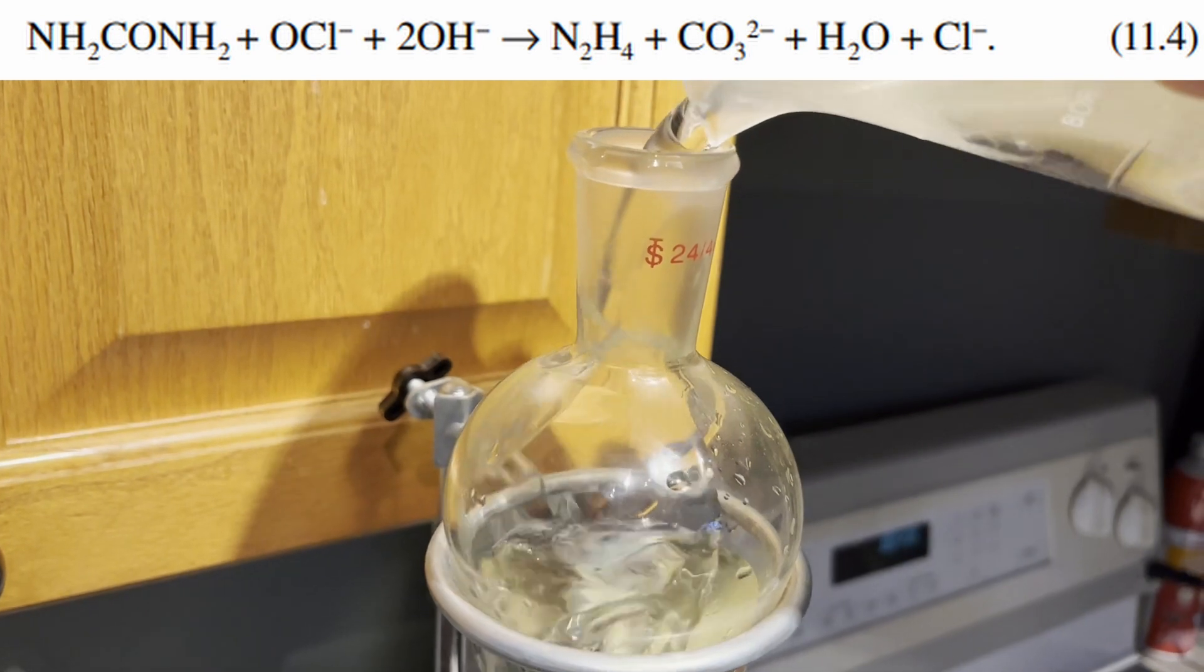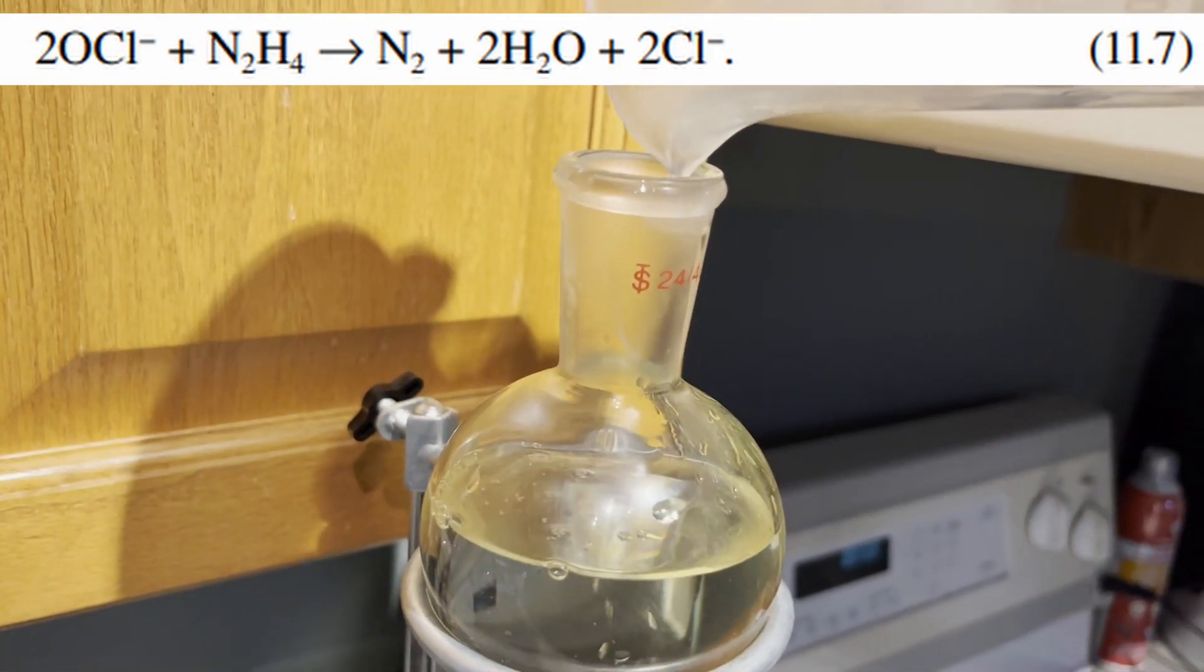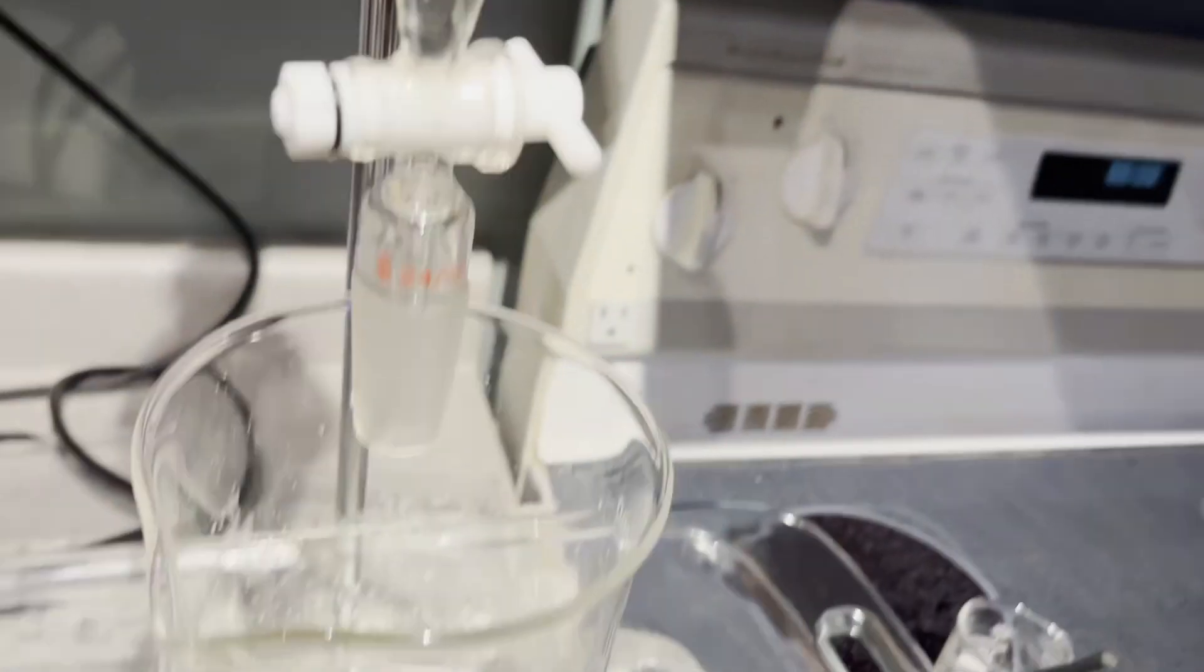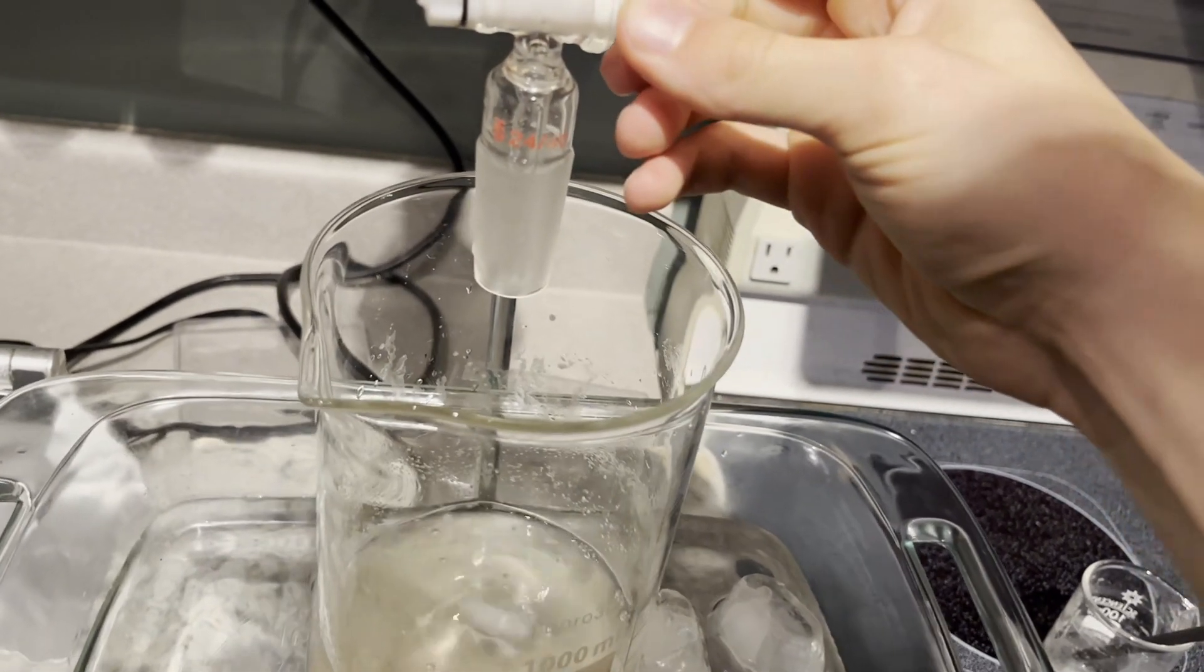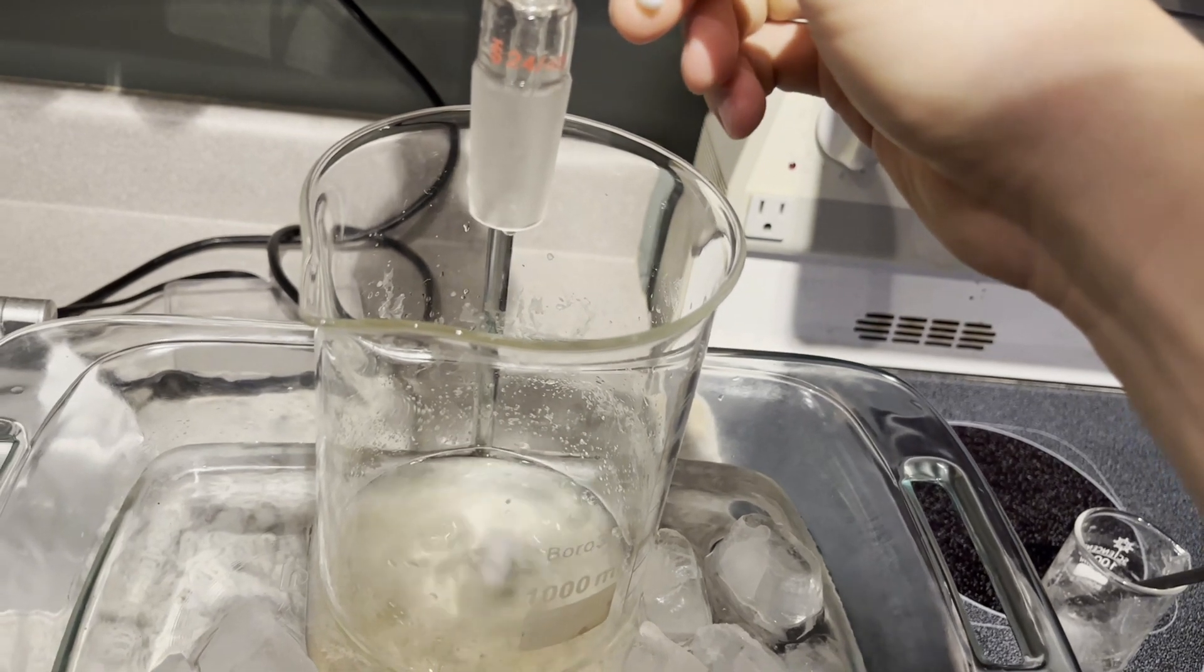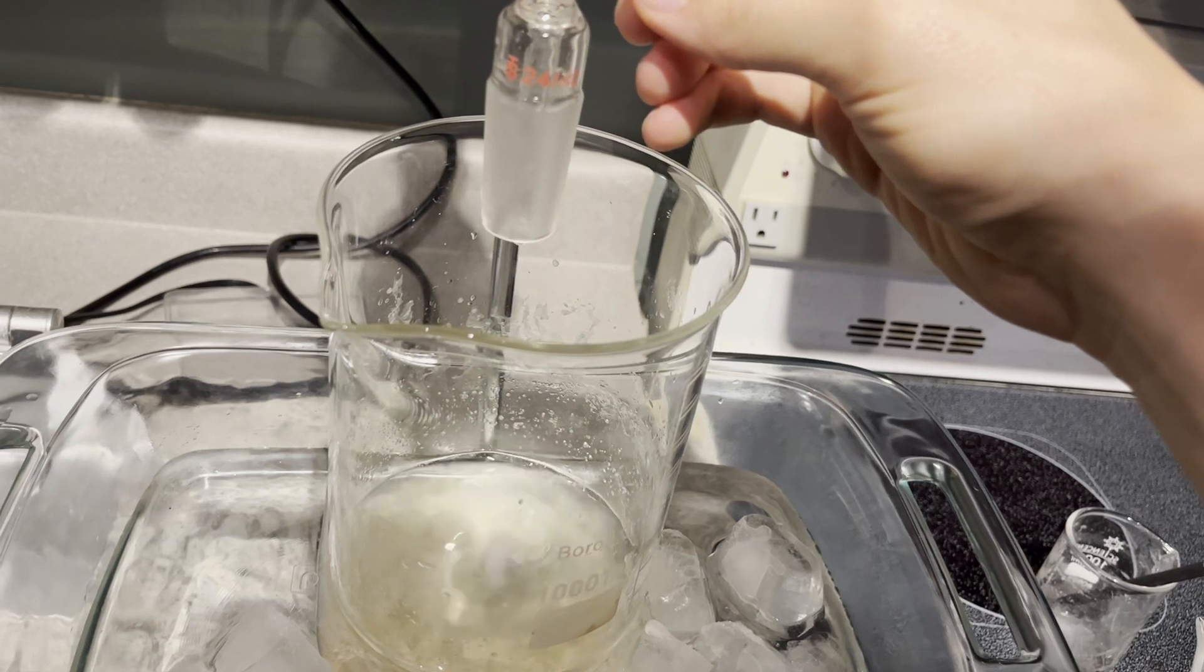Reaction 11.4 shows the synthesis of hydrazine and this is the degradation of hydrazine in the presence of any metal ion catalyst. The bleach should be added in such a way that the temperature doesn't rise above 10 degrees Celsius. This should correspond to about 5 or 6 drops per second and the total addition taking a little over 30 minutes.